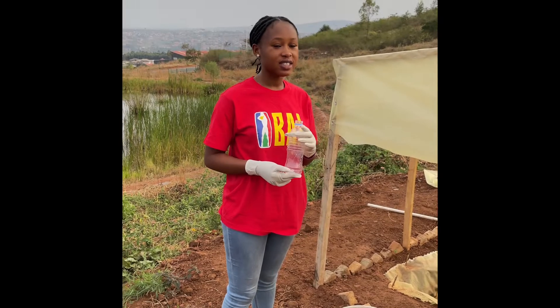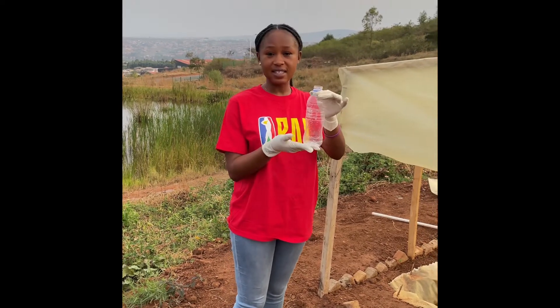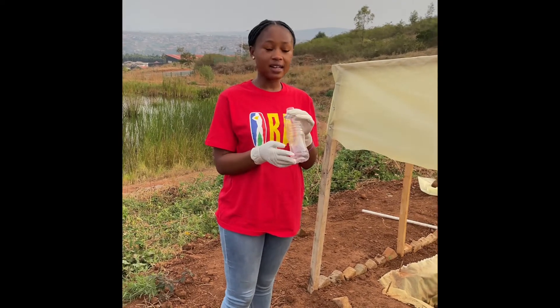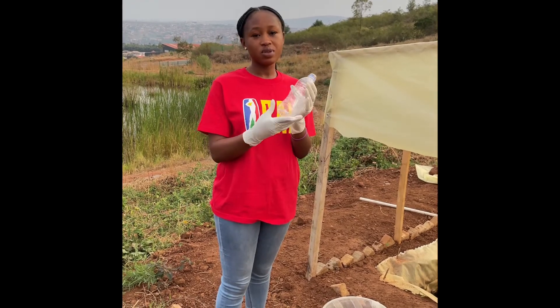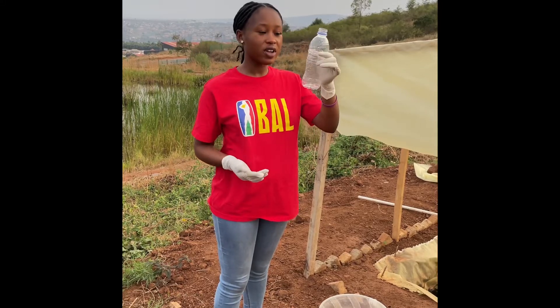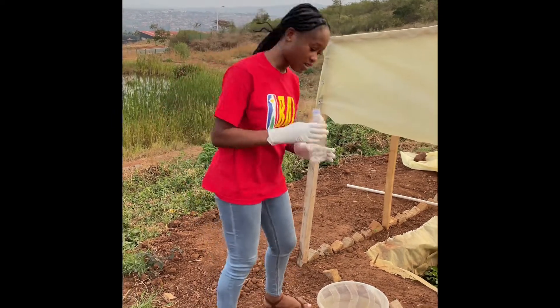For the testing of the biogas, I'm going to be doing the water displacement method. I'll be using this test tube, inverting it into the water to see if there's gas produced. If gas is produced, there will be space under this even when it's filled with water. I'll first fill this test tube with water and then proceed to the next phase.